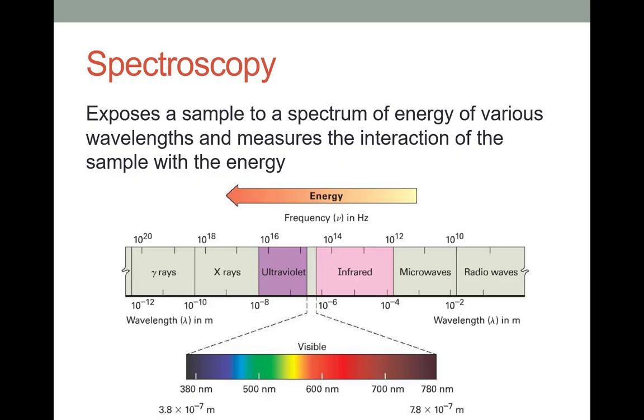So at its core, IR is a spectroscopy technique. And in general, spectroscopy involves bombarding a sample with light in a particular region of the spectrum. So we could talk about visible spectroscopy, we could talk about ultraviolet spectroscopy. In this particular case, we're talking about infrared spectroscopy. And even more narrow than this, we're talking about the very near infrared, so sort of closest to the visible spectrum here. We are bombarding a sample with that wavelength of light or a number of wavelengths of light in that region and looking at which ones of those are absorbed.